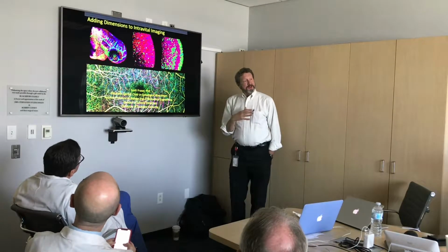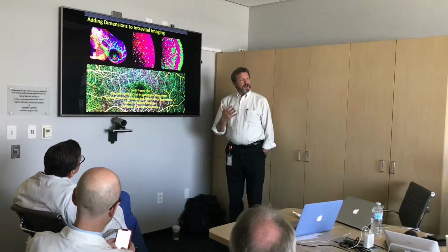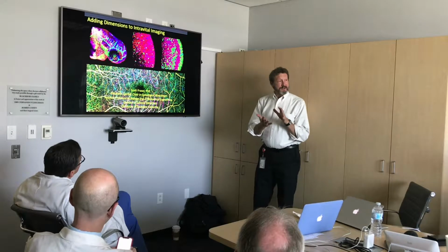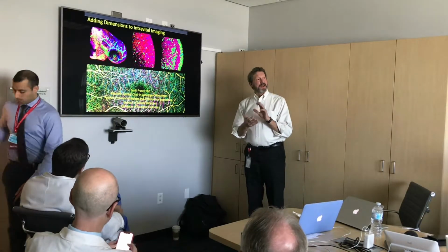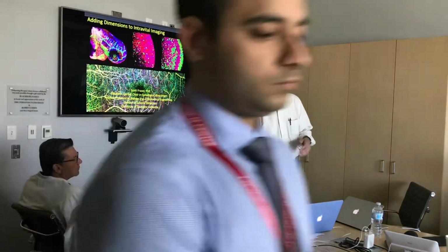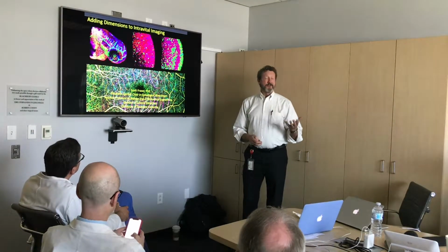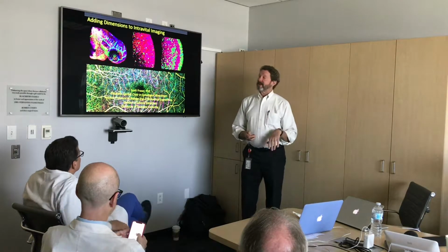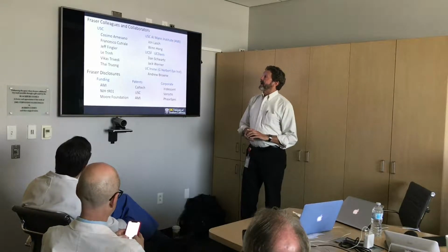But some of the work we've been doing trying to apply multispectral and lifetime imaging to add dimensions to the sort of imaging we're normally doing, and also to tell you a little bit about the way we're trying to apply our multiplex labeling technologies that let us apply to both experimental animals and to clinical samples, multidimensional imaging of spatial genomics issues.